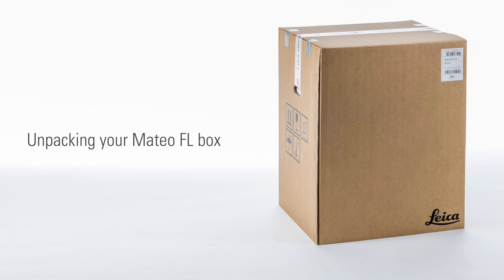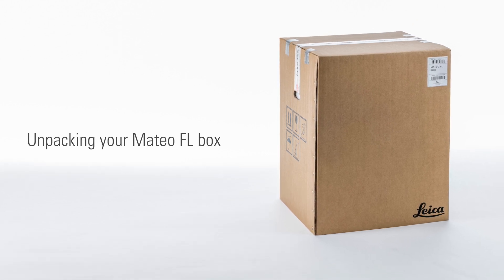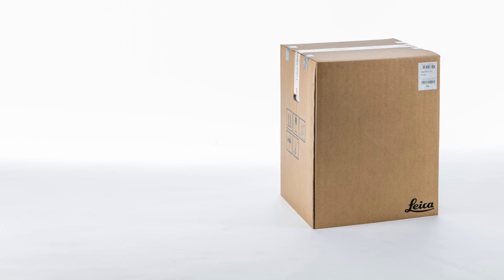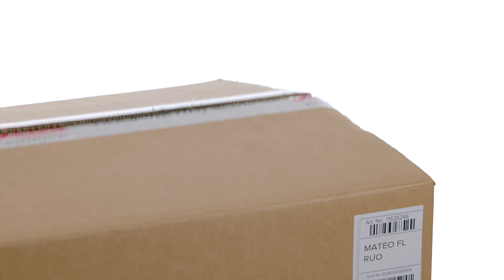Place your Mateo FL box on a clean, flat and stable surface, preferably on the ground. Carefully open the box.